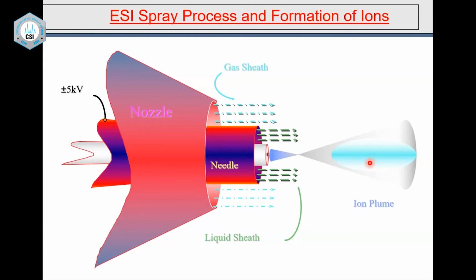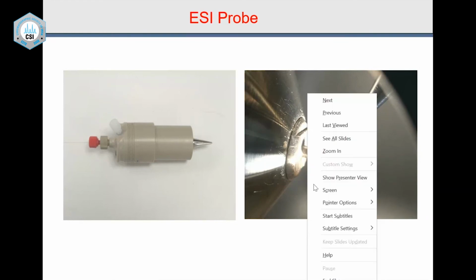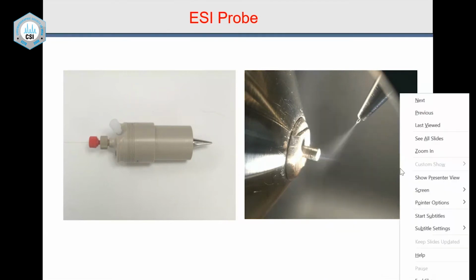Now when you dry them, there are different processes, and this is an actual mass spectrometer, a photograph taken inside. I'm very happy to show it to you. You can see it in some of the journals also. It is spraying, as you can see, a lot of spray, and the salts and everything will stay outside the mass spectrometer, and the ions are sucked into the mass spectrometer. This is part of the ion source, and the ions are sucked inside. This is the bilayer needle, as you can see. It is very important for you to see these things, and I will move to the next slide.